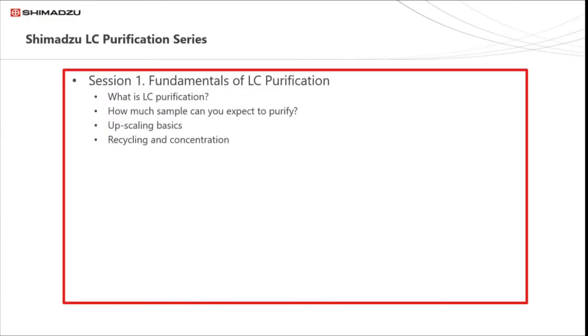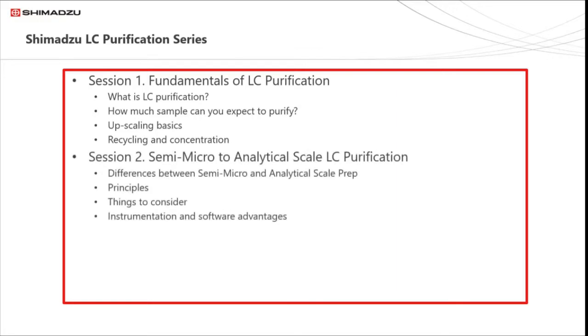The Shimadzu LC Purification webinar series will consist of 3 sessions. The first today is titled Fundamentals of LC Purification. This will include what is LC purification, how much sample can you expect to purify, upscaling basics, and recycling and concentration. Session 2, titled Semi-Micro to Analytical Scale LC Purification, will cover the differences between semi-micro and analytical scale prep, principles, things to consider, instrumentation and software advantages.